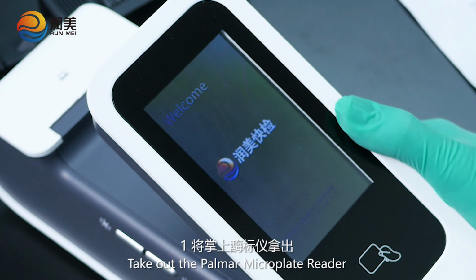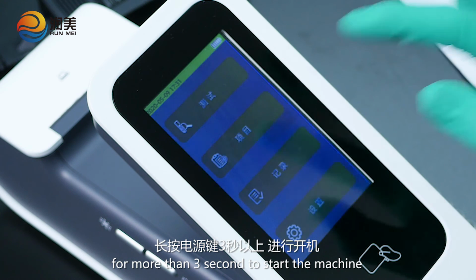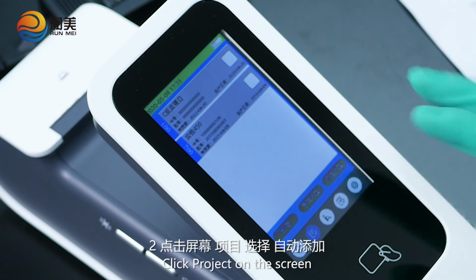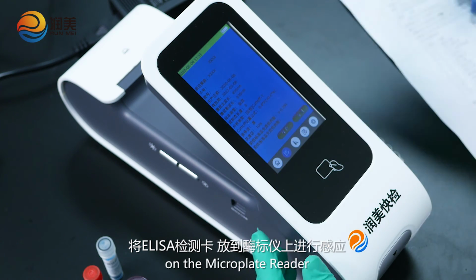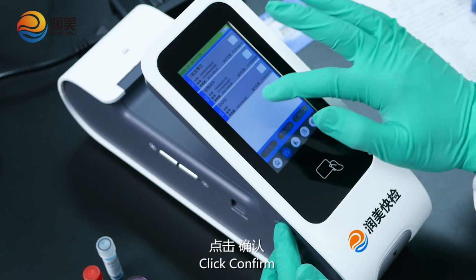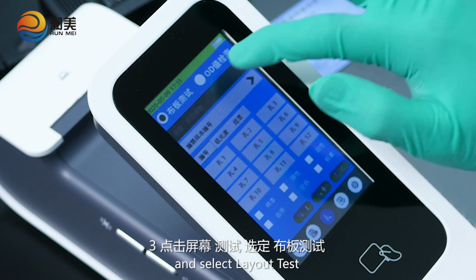Take out the microplate reader. 1. Press the power button for more than 3 seconds to start the machine. 2. Click Project on the screen. Select and automatically place the ELISA detection card on the microplate reader and select Save. Click Confirm. 3. Click Test on the screen and select Layout Test.